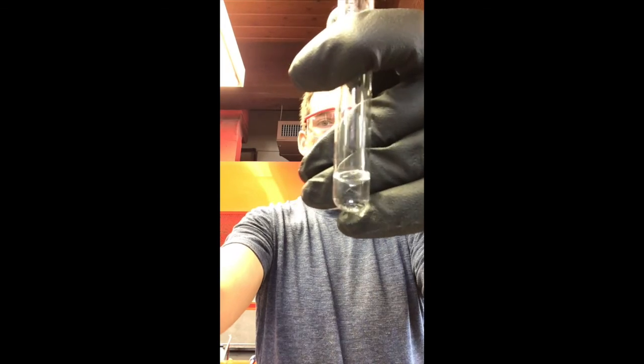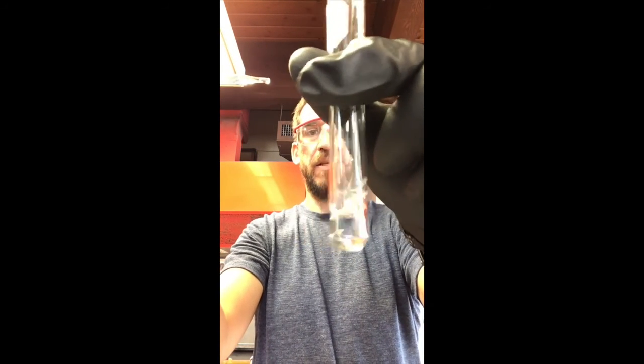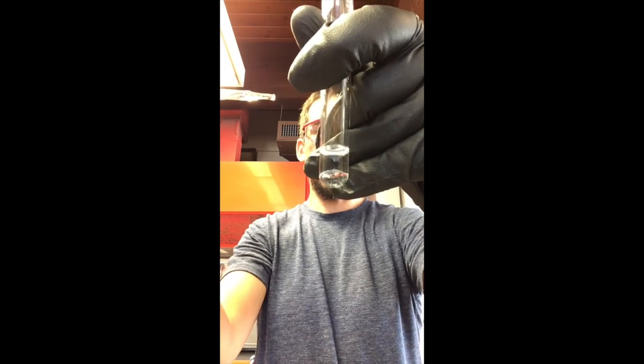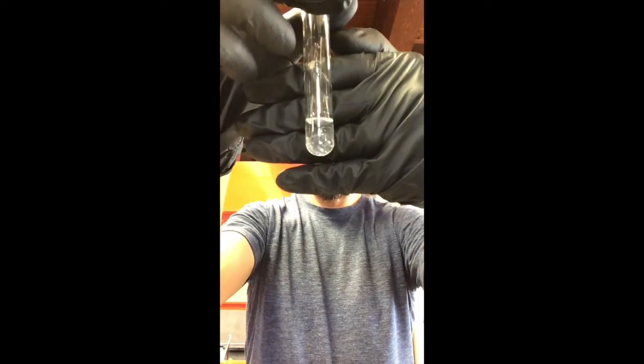Now, you might not be able to see it so easily, but you see that weird little bubble that formed right here? Let's watch that, see if that gets bigger as I add more. Ooh. See how it dropped to the bottom? Cool. Give it a little shake. Watch out, see how it ended up basically at the bottom? So what we can conclude from that is there's 2 layers, right? And this particular substance, unknown 2, went to the bottom. What does that mean? Well, it means that it's more dense than water.